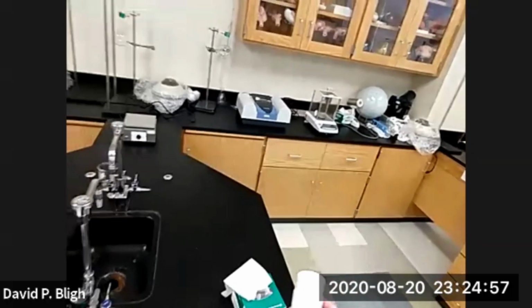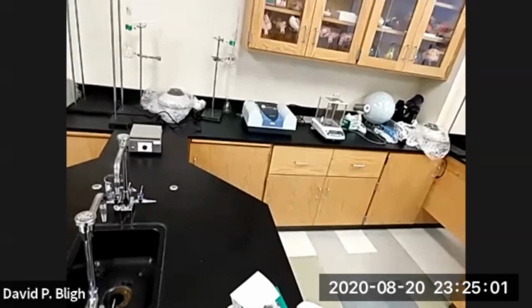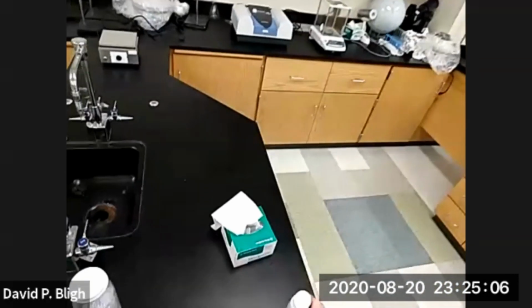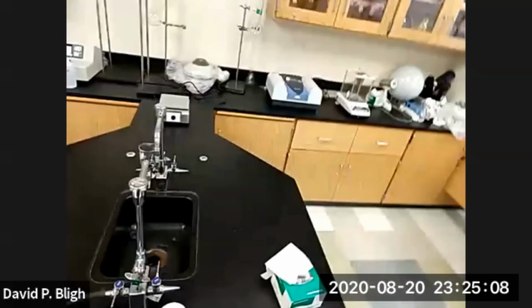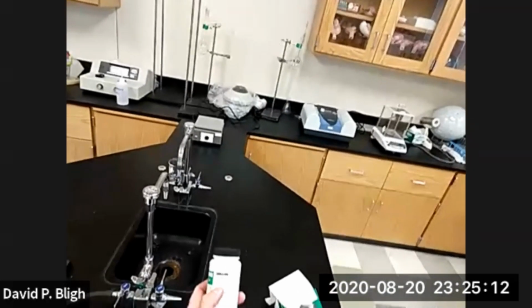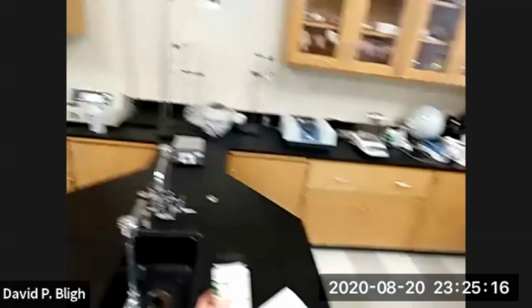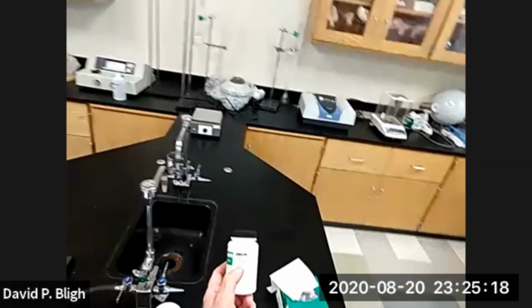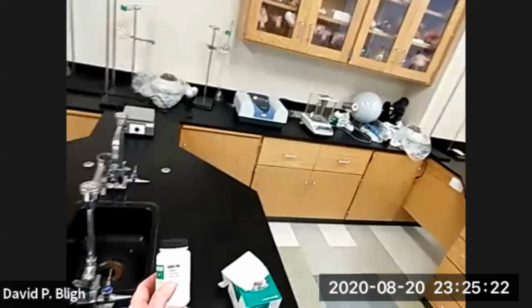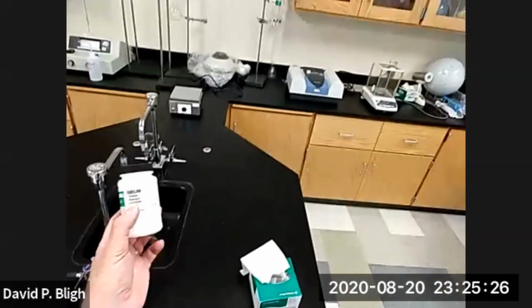That means that the water molecules are intact, separate, but attached to the copper sulfate molecule. Whereas the waters of constitution are incorporated into the formula of sodium hydrogen carbonate. And you don't see the water in the formula until you heat it and drive off the water and leave something behind. That's the difference between hydration and constitution.